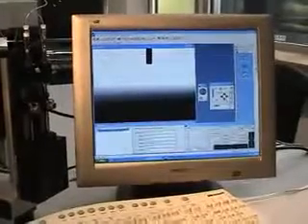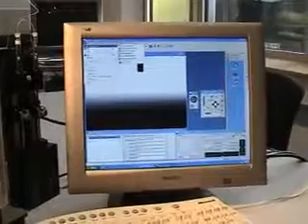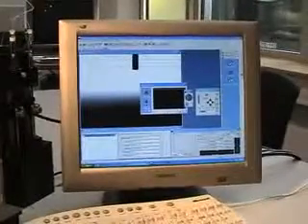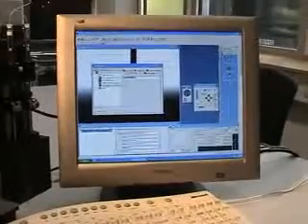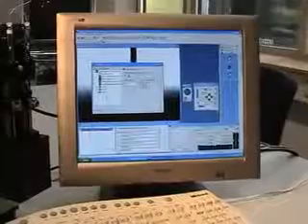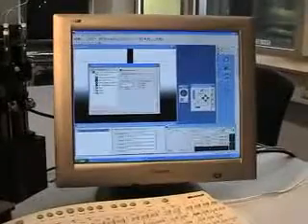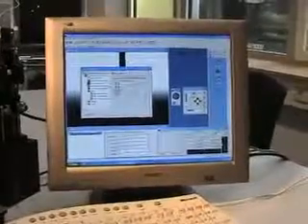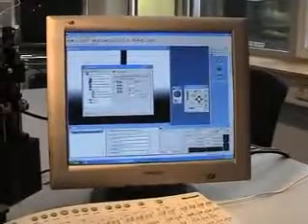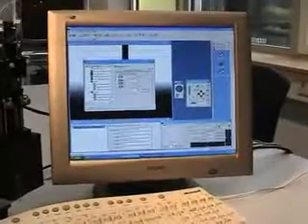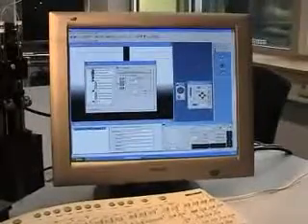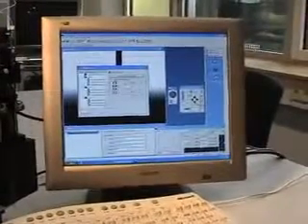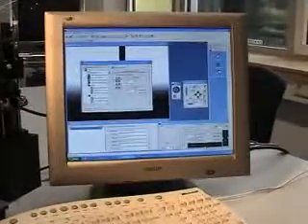We will show next the procedure how to make an automatic measurement. We are opening here a definition of some macros, assigning several liquids for the measurement, defining the syringes for the liquids, where we can choose up to four different liquids. Also the volumes and dosing rates.